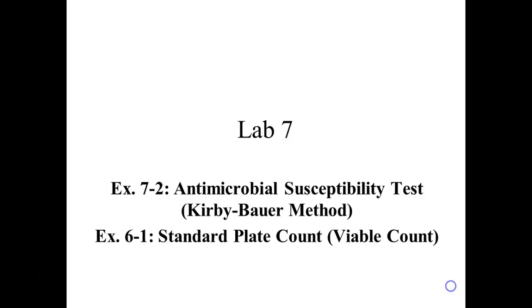Alright, so for today's lab, we started out with antibiotic or antimicrobial susceptibility testing. We used a particular method though. There's a lot of different methods out there. We use the Kirby-Bauer method, or sometimes just referred to as the disc diffusion method, because we put little discs on, right? And what happened? The antibiotic diffused out into the media and affected the bacteria.